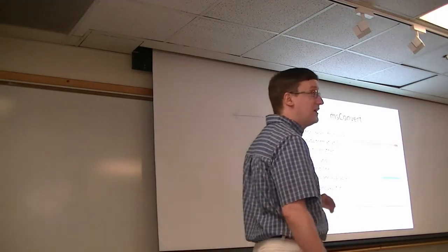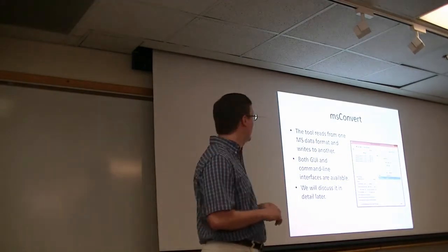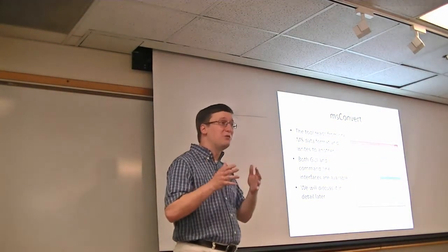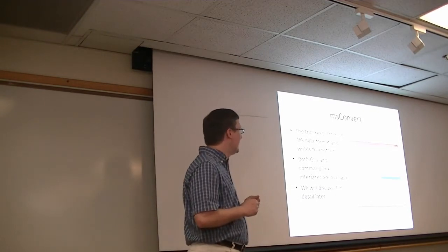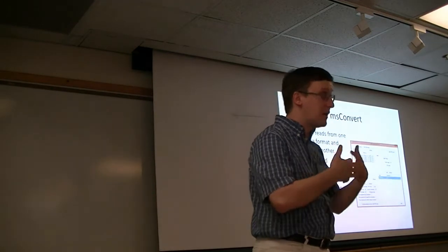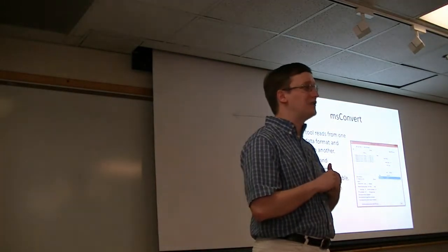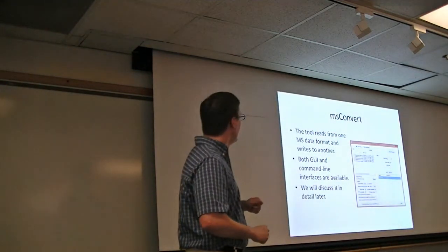All right. Now I've mentioned MSConvert a few times, but it's worth taking a little time to talk about it here. And as I mentioned, later this afternoon we'll be spending a lot more time with it. So essentially we want the ability to read one file format and write another. That's a pretty simple kind of capacity. We have a command line by which we can access this software, and we'll probably spend a little time working on the command line as we get to the later parts of this afternoon. So if we need extra caffeine, we'll find a way to make that happen.